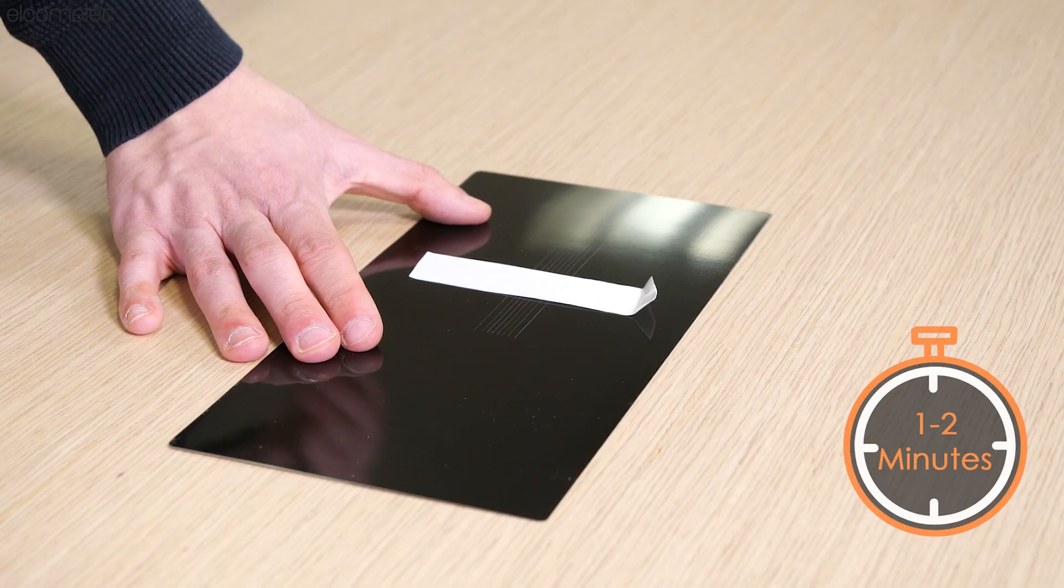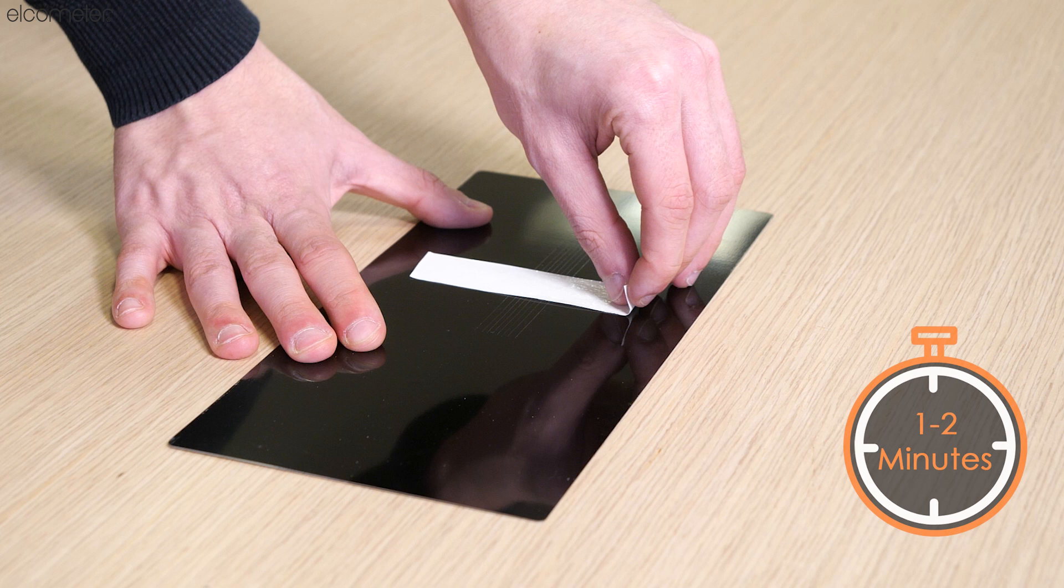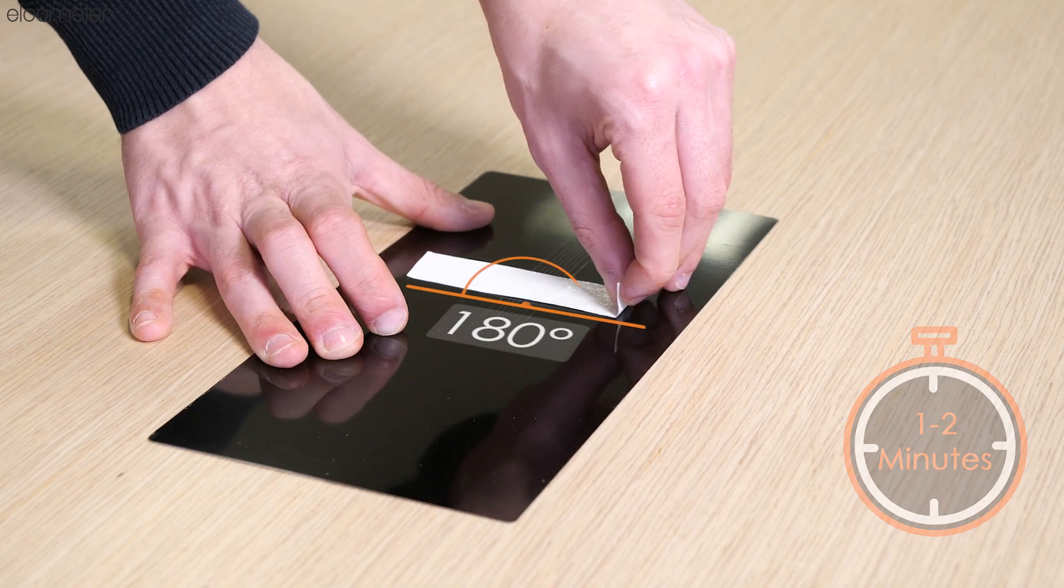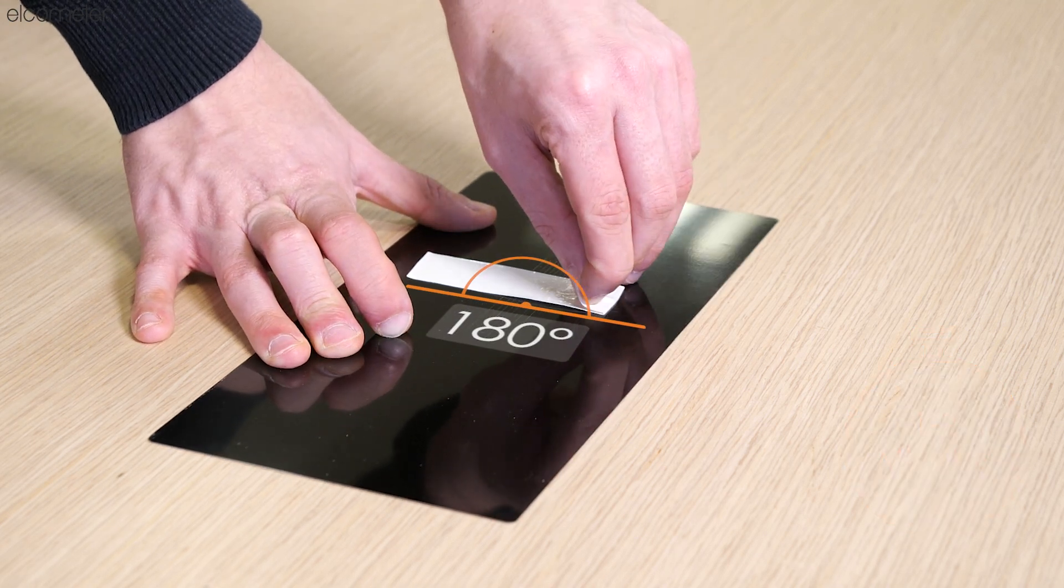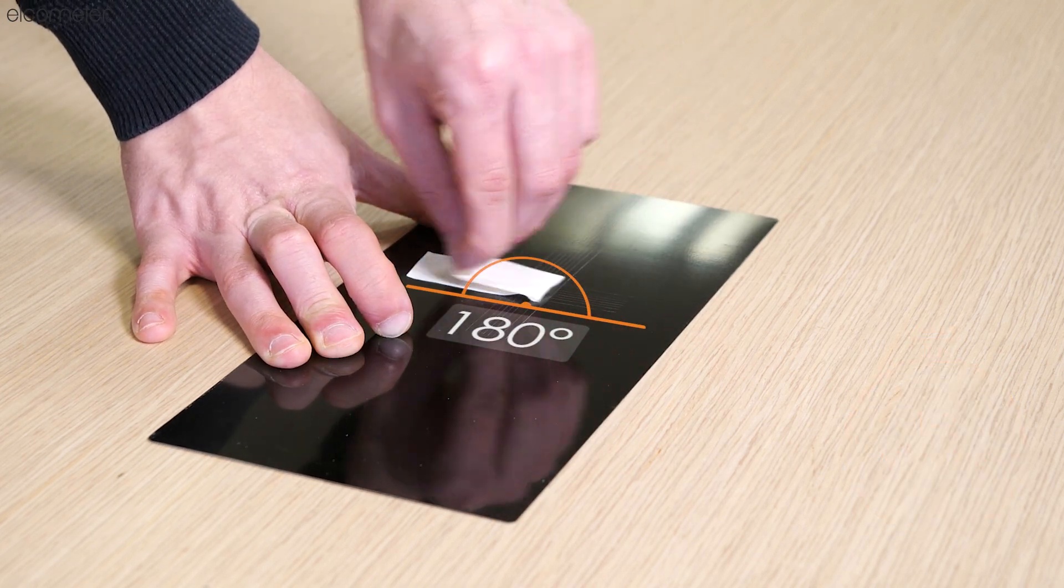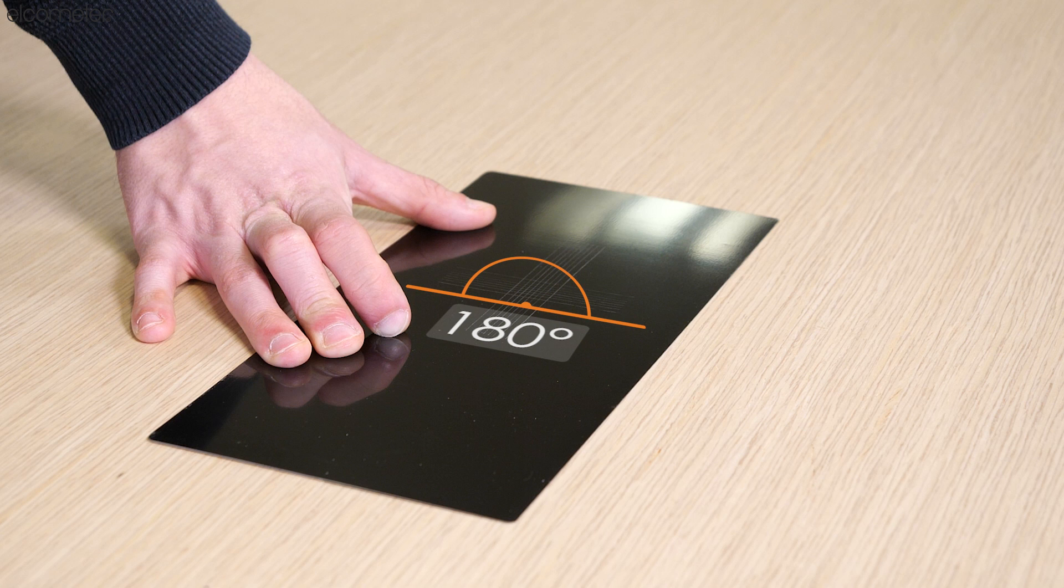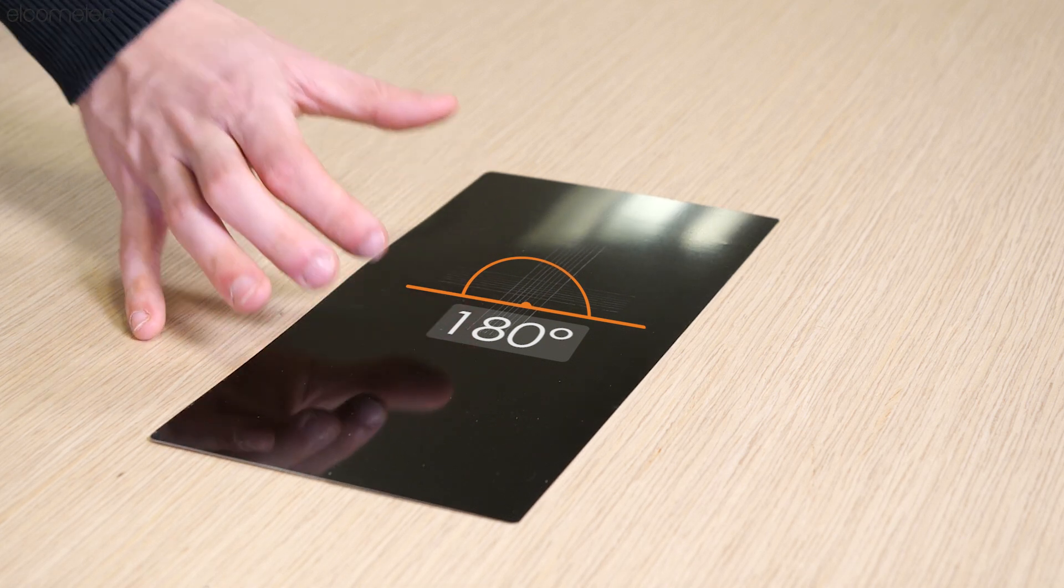Within one to two minutes of the tape being applied, it should be peeled off in a single smooth action at an angle of 180 degrees to the surface.